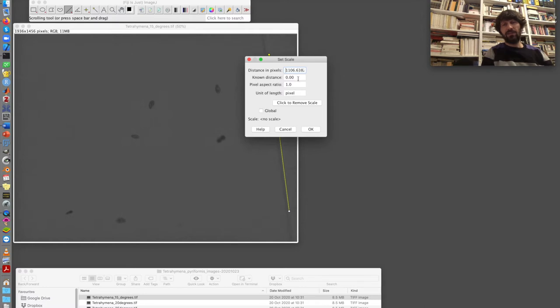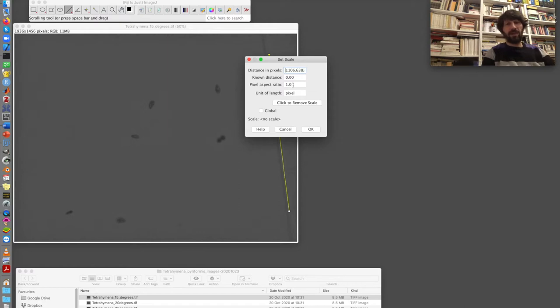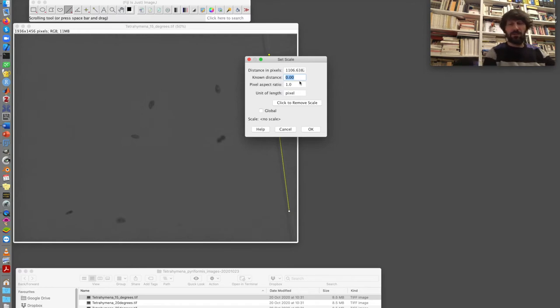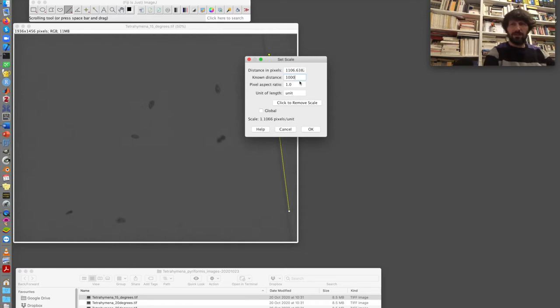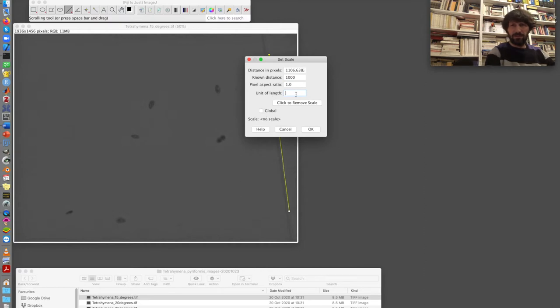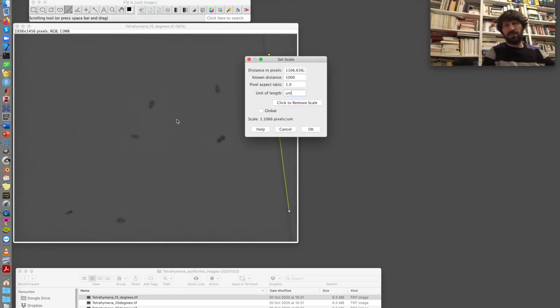I need to enter the length of the line in millimeters. But because Tetrahymenas are quite small, I prefer to use a smaller unit than the millimeter. So I will use micrometers. So I say that these 1,106 pixels are one millimeter, that is 1,000 micrometers. And the pixel aspect fraction is one because the scale is the same on the vertical and on the horizontal axis. And I set to global so that I keep the scale for the next image.